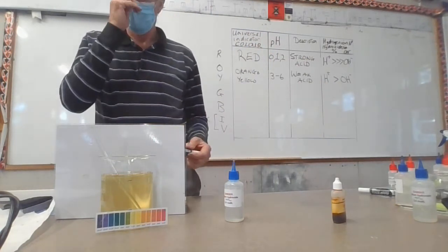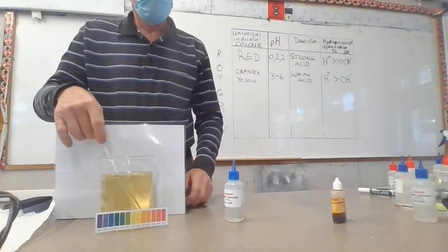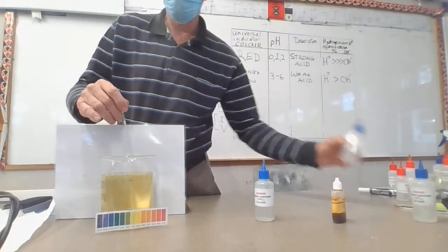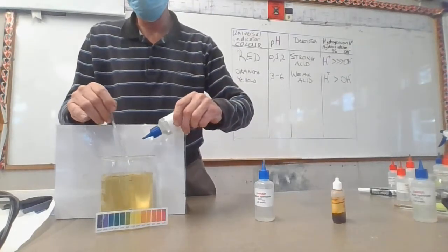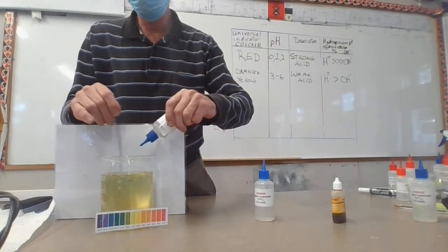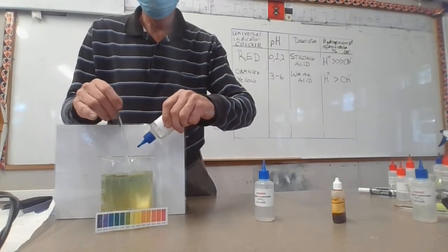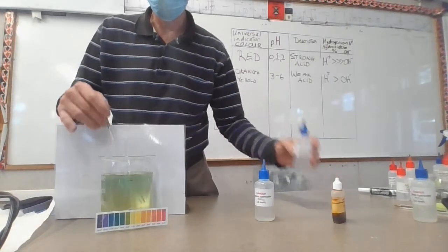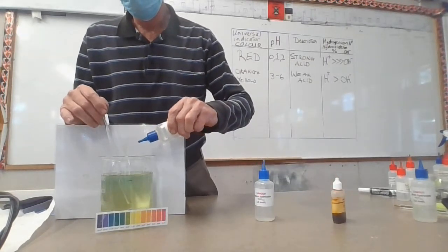Now the tricky part here. We'll be bringing this to neutral. I might use a weaker base here just to get this to the neutral situation, which will be the green color. Here we are, I think we've got a reasonable green color there, maybe just yellowing a bit again.